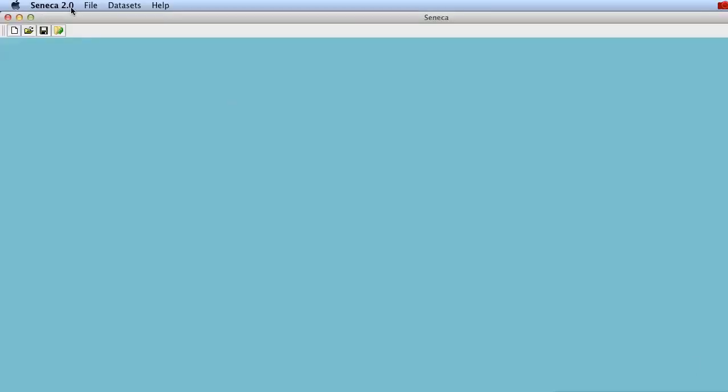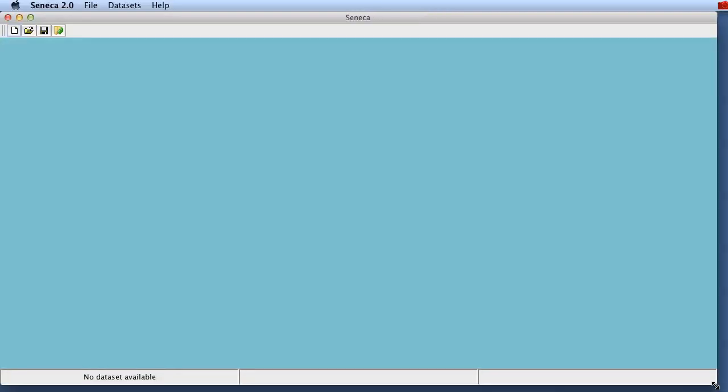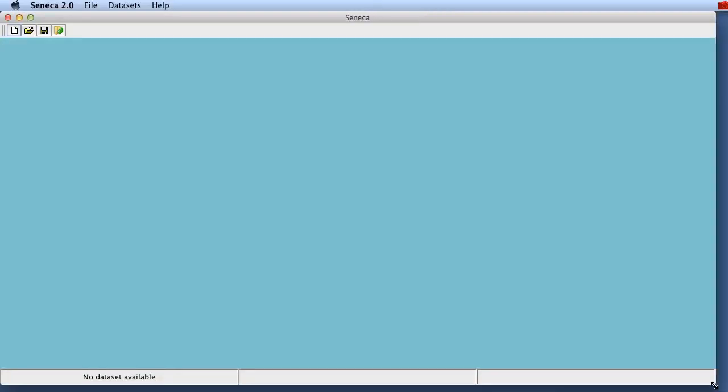Then Seneca loads and basically this is what you end up with. Let's just resize the window to fit into the screencast here and you can see an empty window. No data set is loaded.